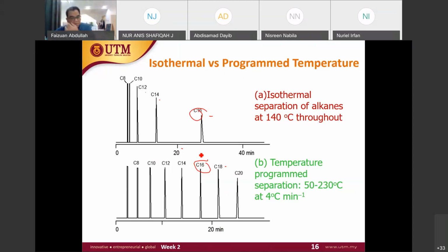All right. Remember in HPLC, if we have compounds that come very late for the elution time, meaning that the compound, for example, for HPLC, this is a column, and then we have the mobile phase, right?